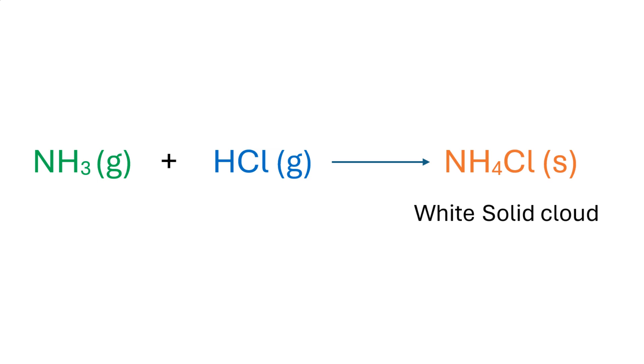The white fumes formed in the tube are actually solid ammonium chloride composed of microscopic particles, creating the illusion that it is in the gaseous state.